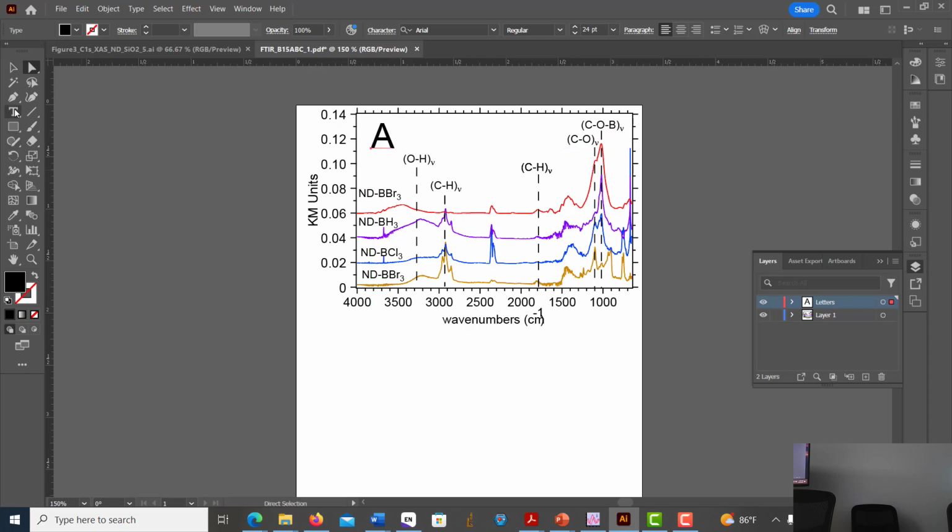Offset it a little bit. Let's say I do want to do Arial bold. I click and drag over it, come down into our drop-down menu, and I'm looking good. Now let's just say I don't want to touch anything else while I'm doing the letters. You come over here into the layers, and you can lock out layer 1.